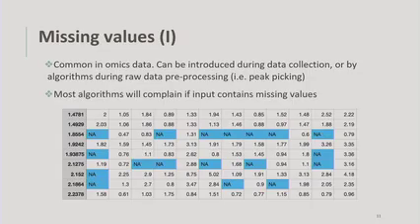All right, the next topic is missing values. So this is really common in metabolomics data. You saw just on the example that Chung showed, there were some NA values there. This is a problem because a lot of the different statistical methods that we use just won't work if we have missing values in them. So we have to deal with them. There's 2 kind of options.